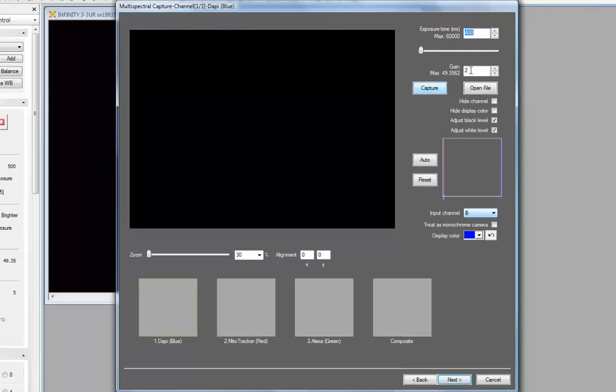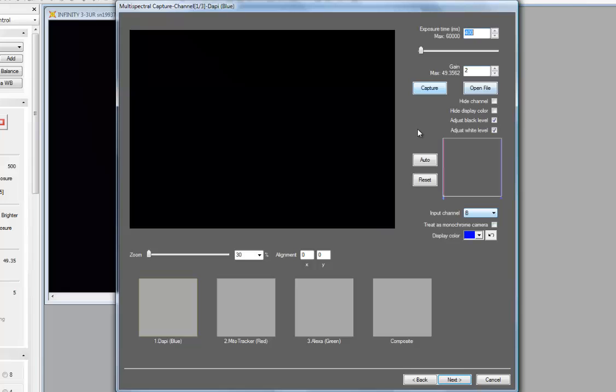When I come back through the Multispectral Capture Wizard a second time, or subsequent times, it will remember the exposure and gains that I have used that are pertinent to my sample, my illumination, my dyes. So the application wizard will remember those settings for you.